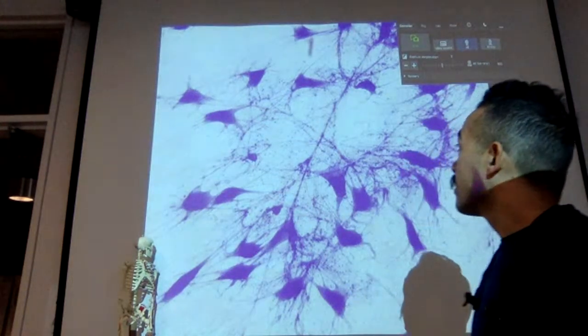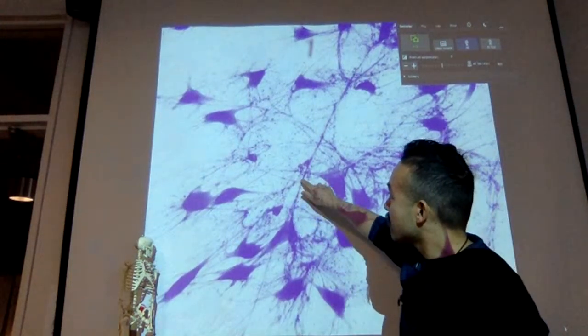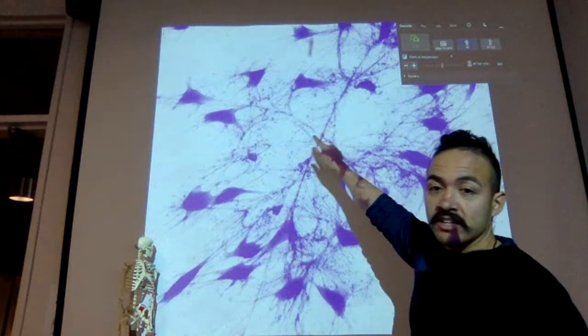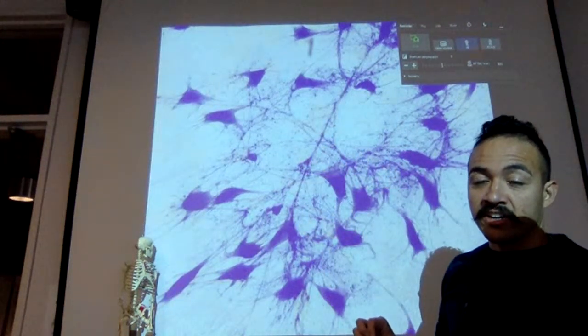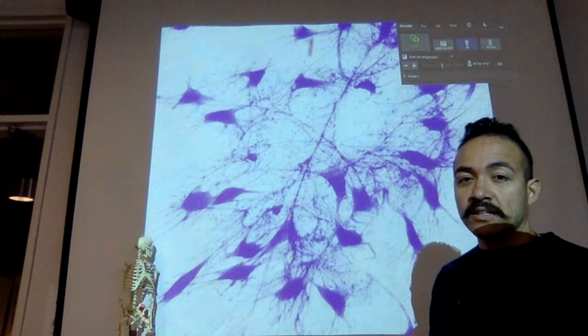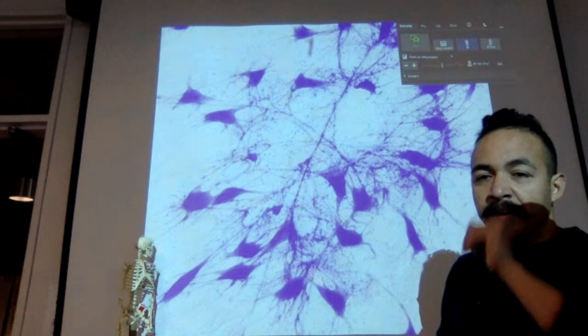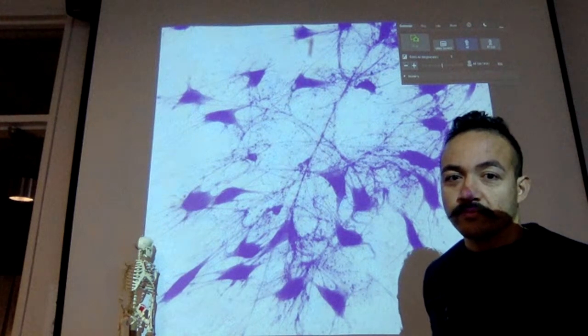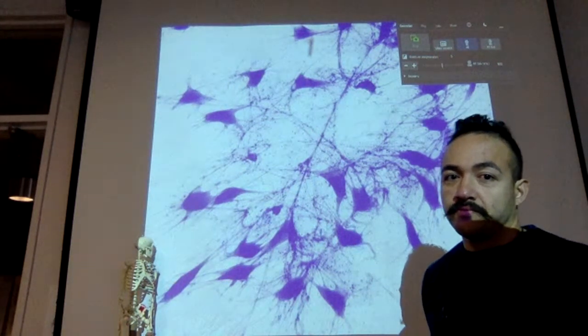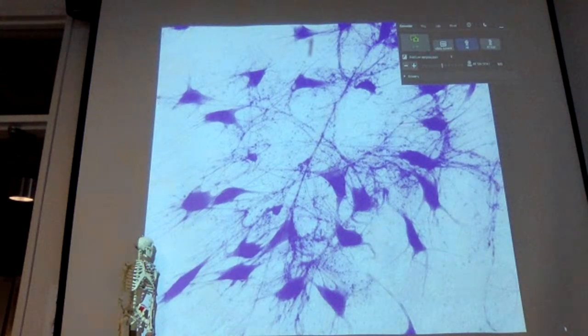Yeah, it's the axon. And if we have motor neurons, we see cell bodies going all along the motor neuron axon. What kind of glial cell would we find here? What kind of glial cell would we find along the axon? That's right, Schwann cells. Because these are motor neurons, their axons extend into the peripheral nervous system. Those would be Schwann cells that are forming it.